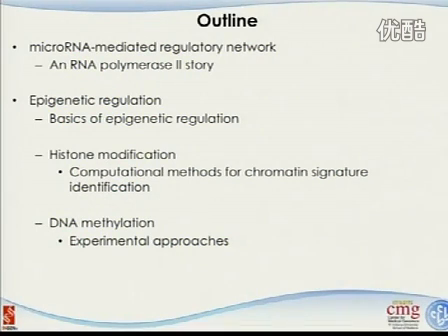What I'm going to give you here is the basic concept of epigenetic regulation, including histone modification and DNA methylation. For the histone modification part, I will tell you one approach. Actually, it's only one slide showing how we do the data analysis on the non-peak finders. And that's the only tool I have found so far, and it was published in 2009. I also asked my colleagues from Ohio State, two professors there, and they didn't even know about this one. So you can see that this is still a research area where the computational part is yet to be discovered.